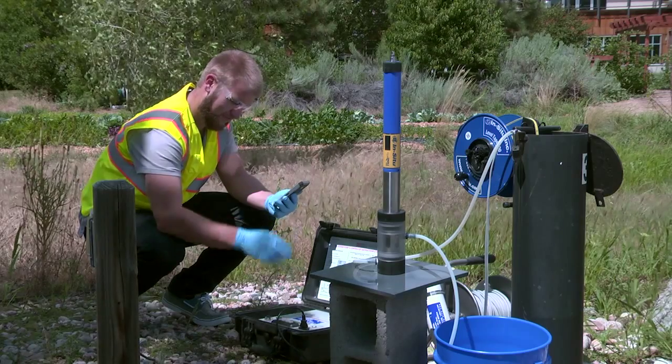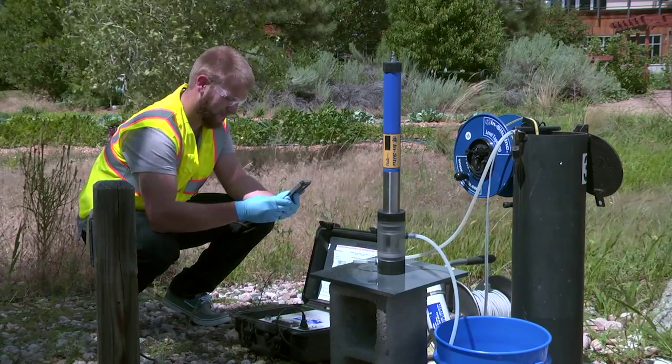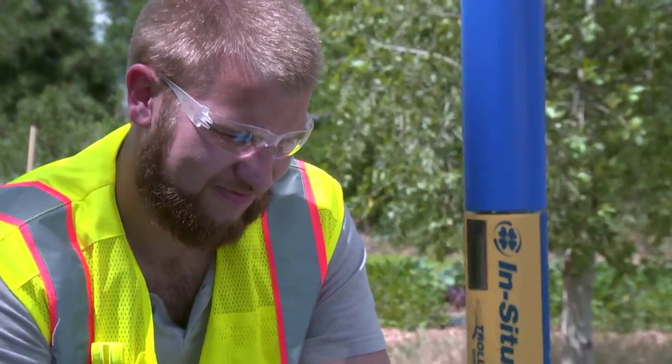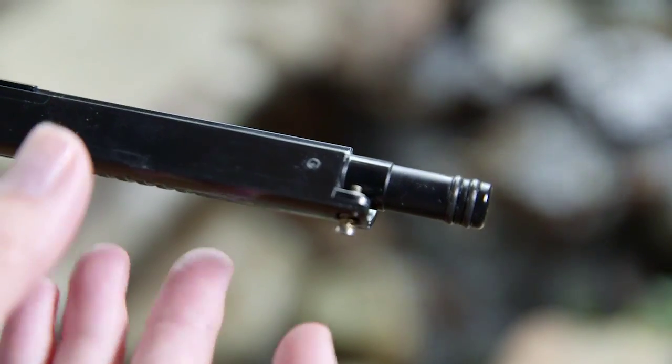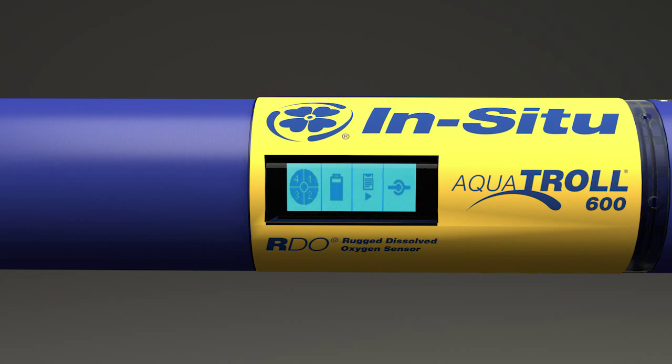Having high-quality reliable data is of course vital to any deployment, but none of that will happen if the instrument isn't set up correctly. That's why we knew from the very beginning that the Aquatrol 600 had to be easy enough for anyone to deploy reliably without extensive training. We started by visiting customers to see how they're actually using the instruments in the field. After learning that a single lost screw can ruin an entire deployment, we designed in captive screws that won't get lost. We added a full LCD readout instead of just giving flashing lights or audible tones. This gives you clear, instant visual indicators of readiness, battery life, internal log, and sensor status. You'll have confidence that your sonde is ready to use and working perfectly every time.